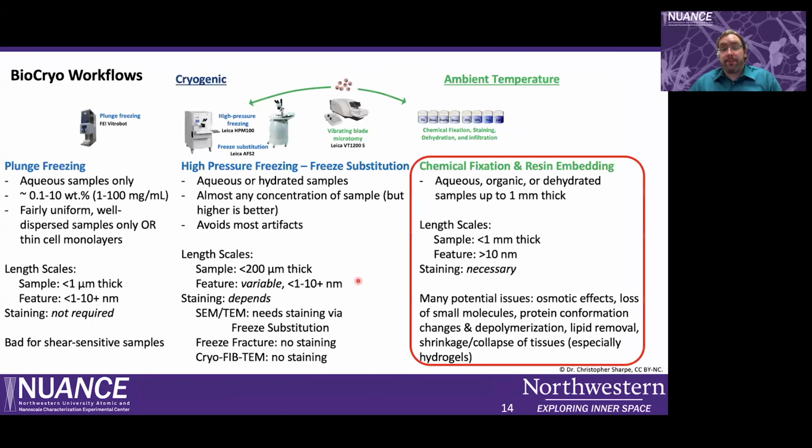So that's chemical fixation. I just want to reiterate that the potential issues you have with chemical fixation have to do with not matching your buffers properly and overwashing your samples. Or they're just unavoidable with chemical fixation because we are going to have to change phases if you're starting with an aqueous sample. To avoid a lot of those issues, you can work on refining your protocol a little bit.